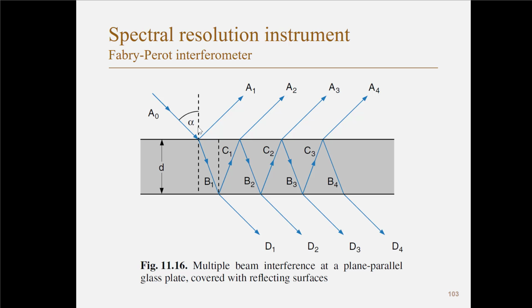Sometimes a Fabry-Perot interferometer is really used like this, but for the Fabry-Perot spectrometer the light actually comes in straight most of the time. So what happens here is that some of the light is reflected at the first surface, some of the light leaks in, is reflected back, and then it leaks out here, and then it's reflected, and then it leaks out here. And all of these different light fields interfere, and the difference in how long they have traveled is how far the beam has traveled going through the Fabry-Perot interferometer. So that means that you get regular interference fringes from one of these Fabry-Perot interferometers.